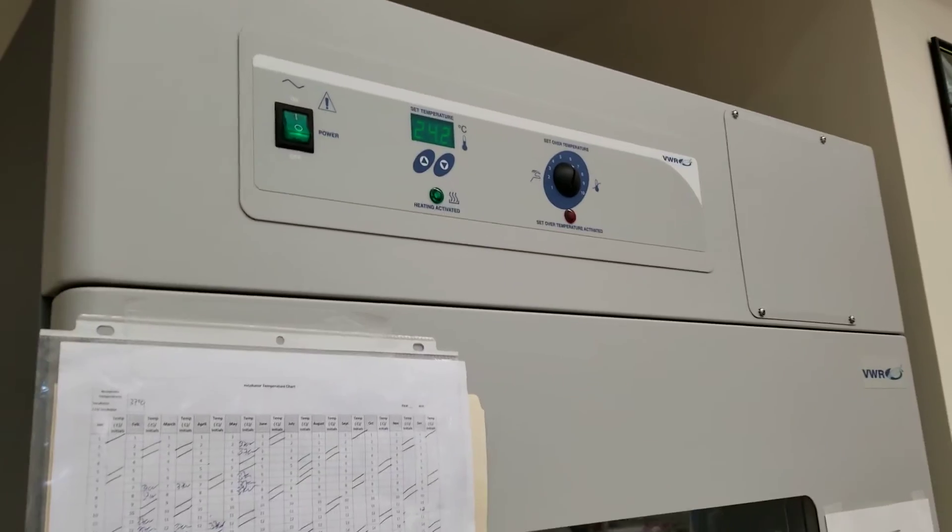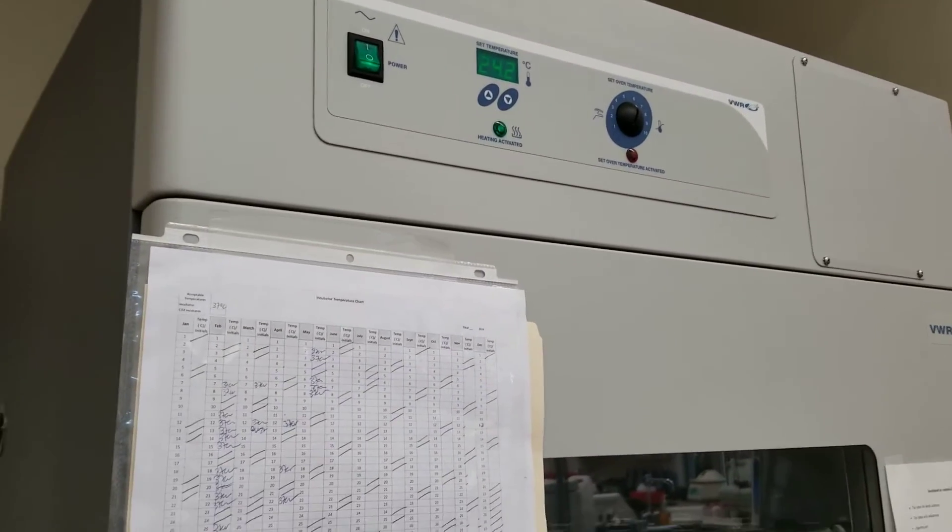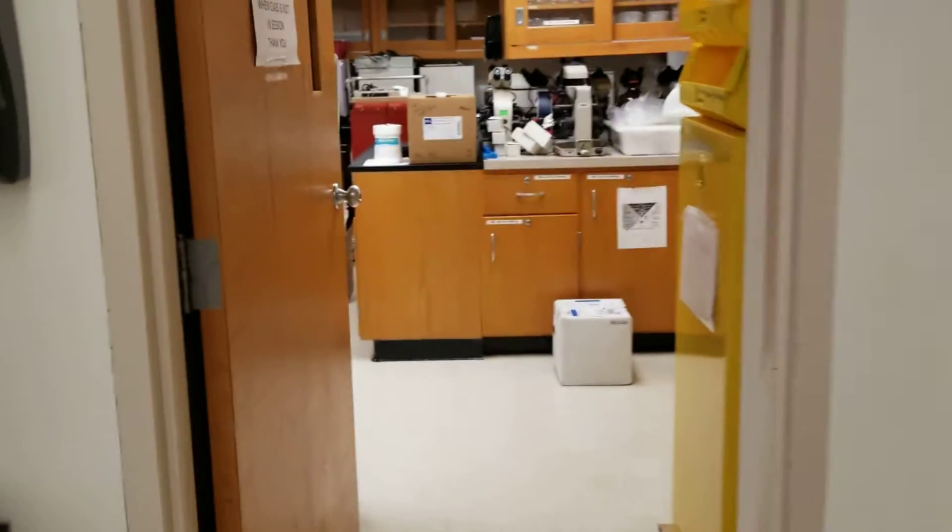So that is where you would go to look for your temperatures on both of those. The other temperatures that we will look at are in the prep room, and then we have the dry blocks as well.